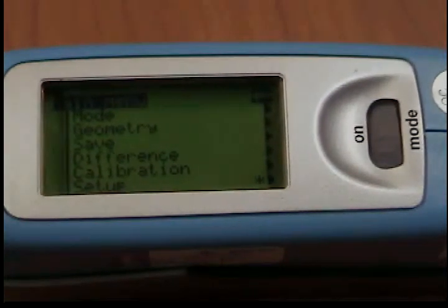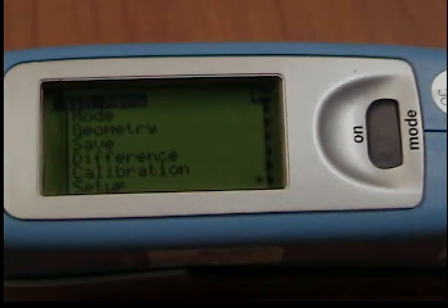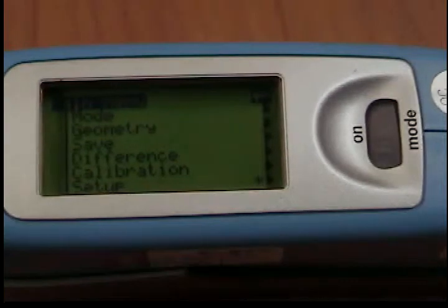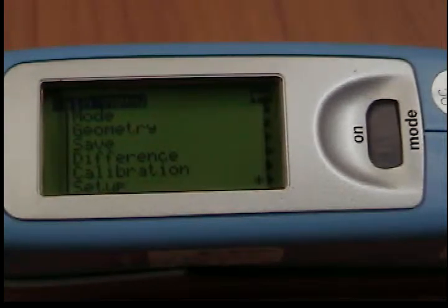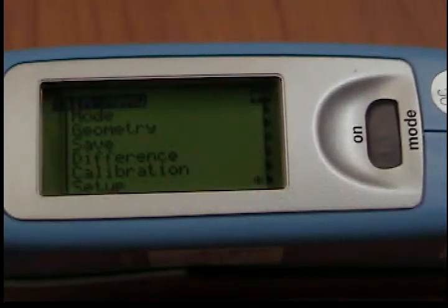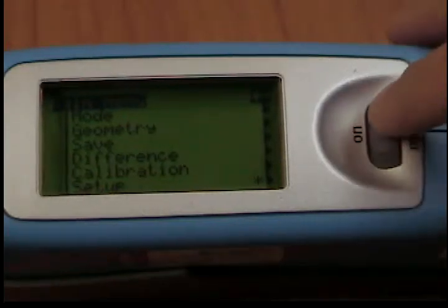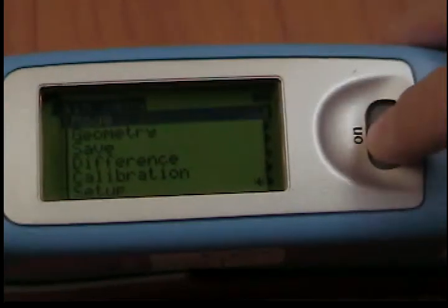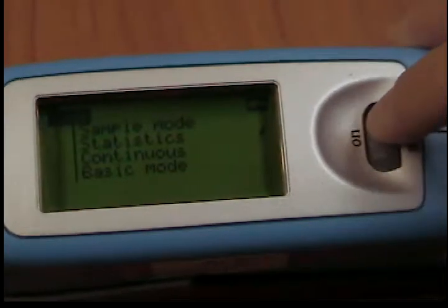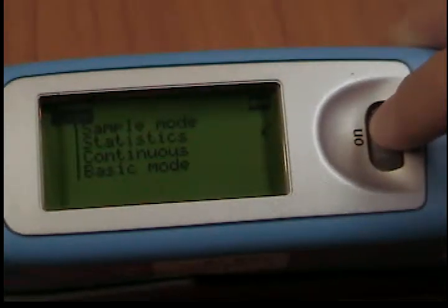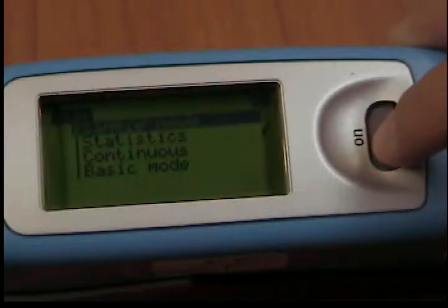How to use sample mode on your Myko Tri-Gloss Gloss Meter. You can select from different types of measurements, recording, and evaluation in the mode menu. The mode that is activated is identified by a check mark. Select sample mode.